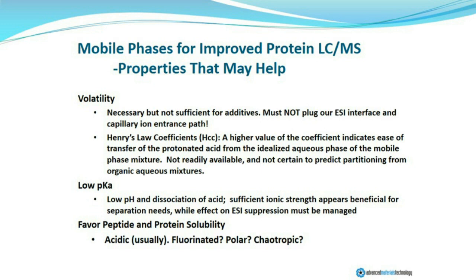The last thing we want to do is plug our electrospray interface in the mass spectrometry experiment or gum up the capillary ion path. The second that we tried to look at was so-called Henry's law coefficients, which describes, again, the ability to volatilize a component from aqueous solution. As it turns out, many Henry's law coefficients are just not available for the things that are most potentially useful.